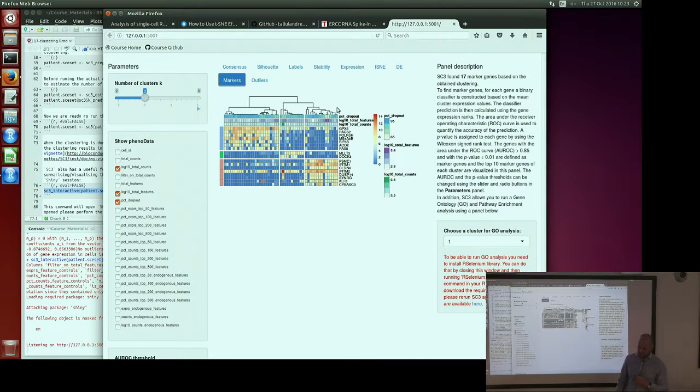So in this context, the meaning of differentially expressed genes may be different from upregulated or downregulated genes. Yes, this is true. That's how we define differential expression ourselves.